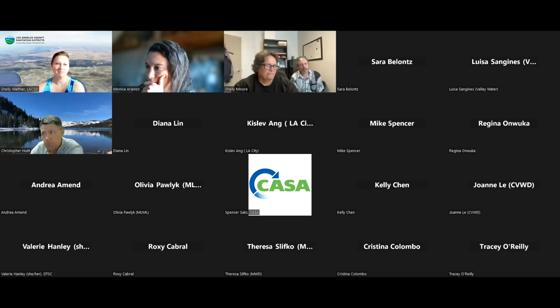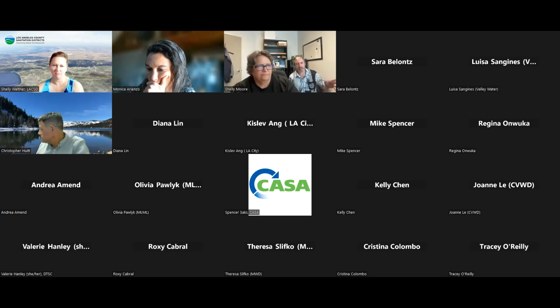Yeah, well, I hope that there'll be more standardization, and I don't know which of these methods is going to be the best, especially for subsampling, for count-based, because that's not my expertise. I have just a little, but you know, my colleague Jeff Wagner at California Department of Public Health, who pioneered some of this precision work, he's an asbestos counter, so that's where we came from with that particular analysis, right?